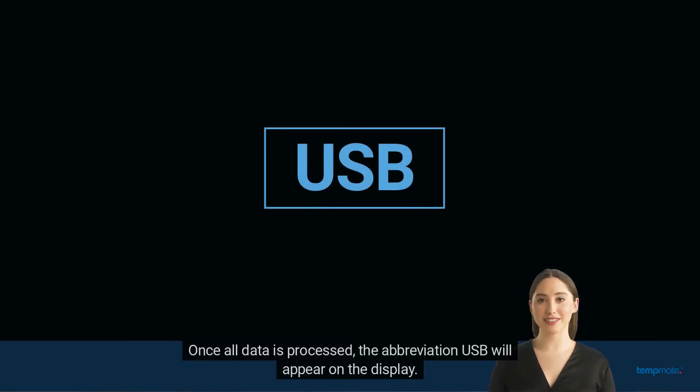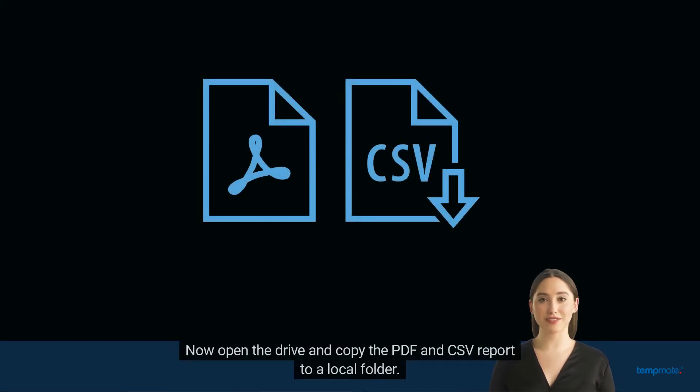Once all data is processed, the abbreviation USB will appear on the display. Now open the drive and copy the PDF and CSV report to a local folder.